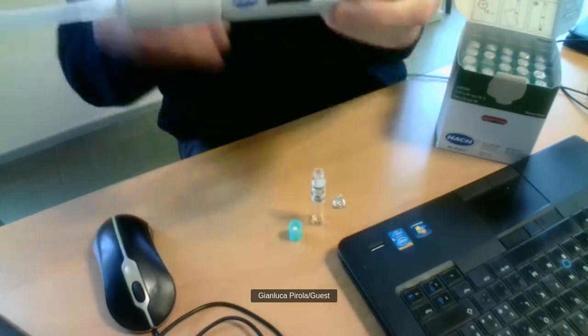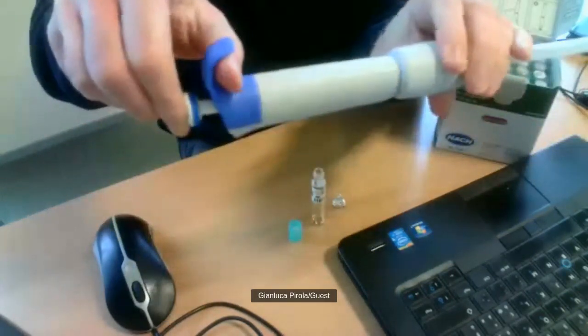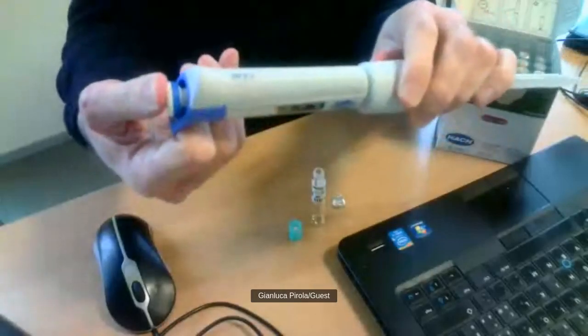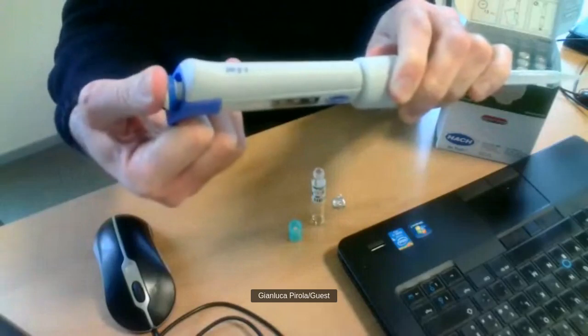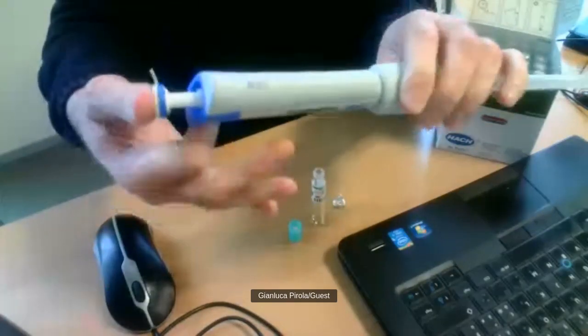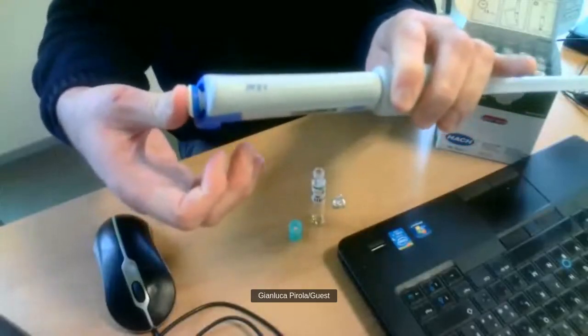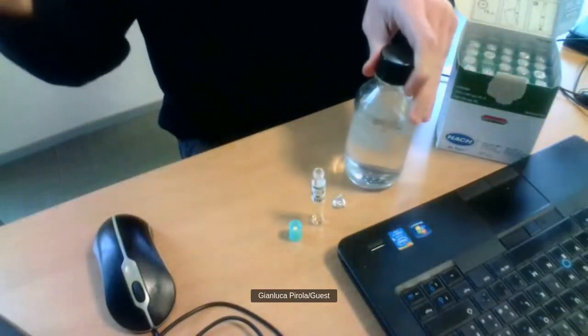Okay, 5 milliliters. As you can see, there are 2 pressure points. This is the first pressure point, and this is the second pressure point. You have to do it physically. Seeing is not enough. First, it stops, and second. I have here a sample of water.